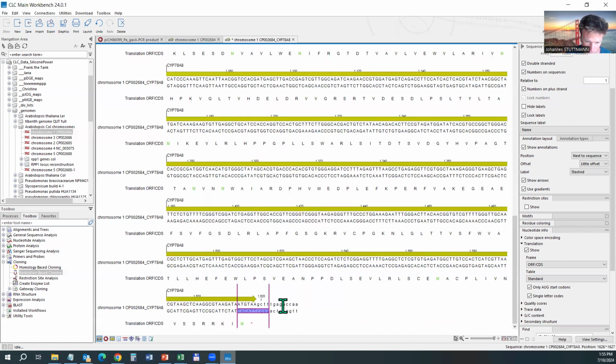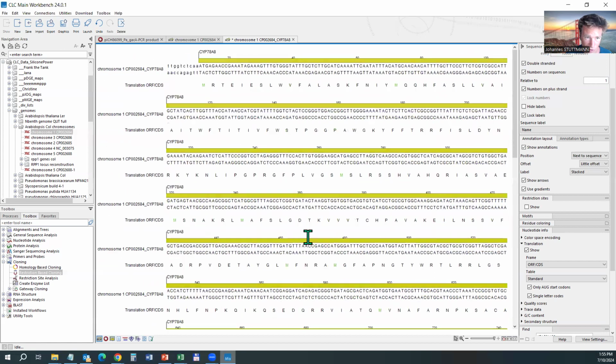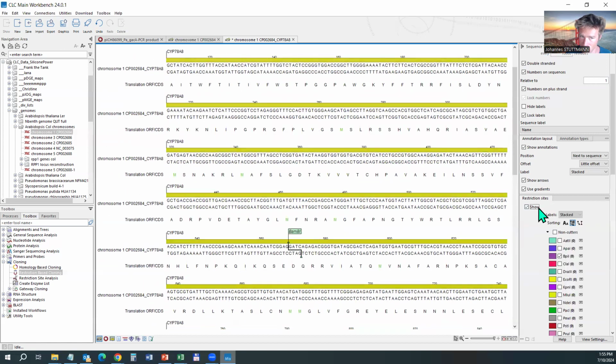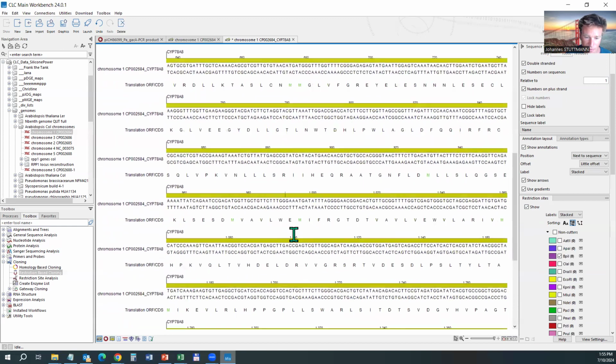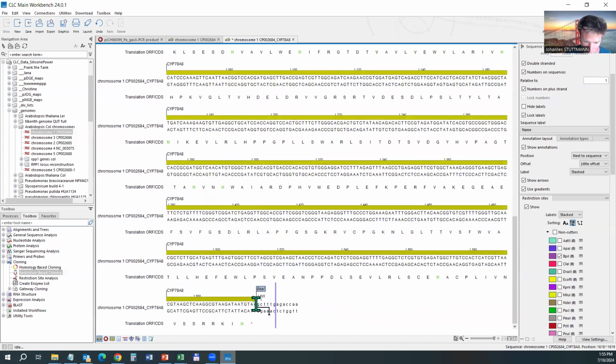And there I go. So now, if I have BsaI displayed, I have an AATG overhang that is cut here. I have a GCTT overhang that is cut here, and I did not have to invert the restriction site in my mind. Again, if I want to make primers, so now it's Arabidopsis, it's actually in many instances quite GC poor. So maybe I want to use a bit more here, 22 nucleotides up.